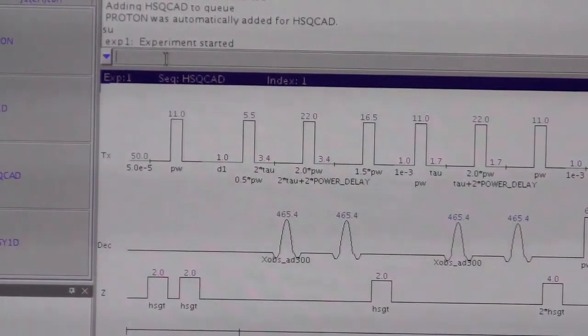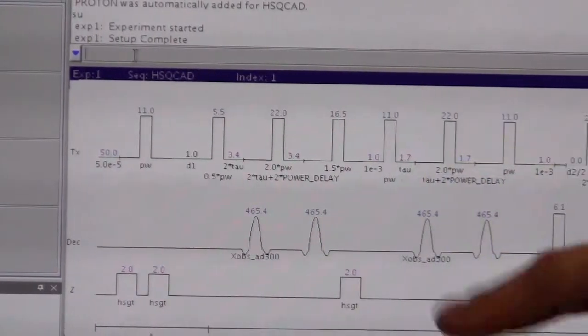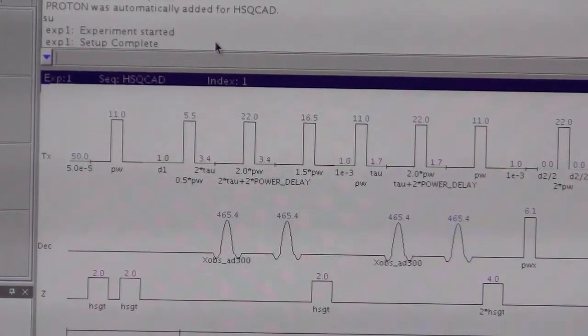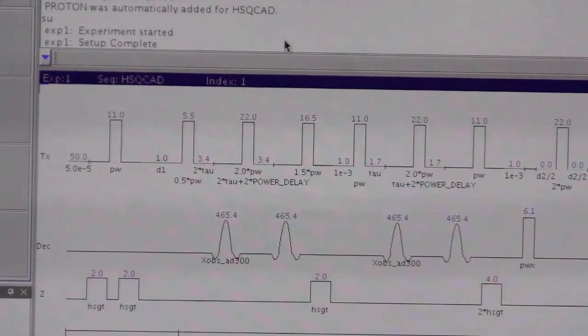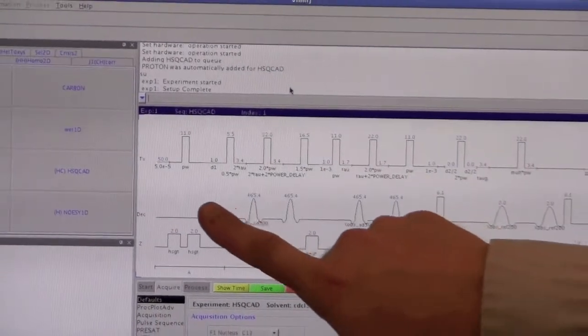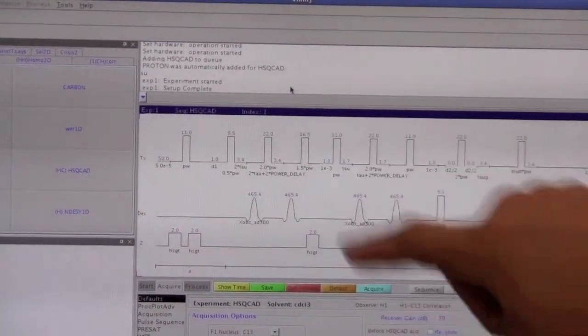The reason for typing SU is to configure the channels so they are at the right frequencies. Some experiments will have channel 1 as carbon and channel 2 as proton, and some will have channel 1 as proton and channel 2 as carbon. Those will affect how we tune the instrument. For the HSQC we're using, channel 1 is protons and channel 2 is carbon. That's done after setup.